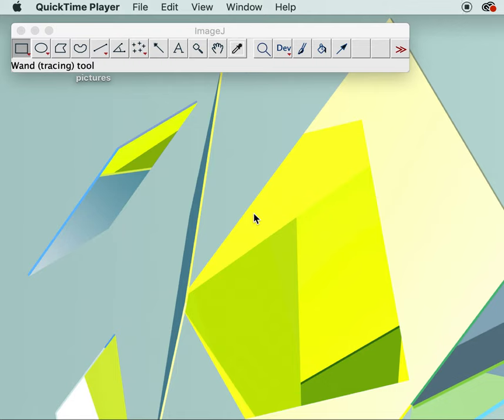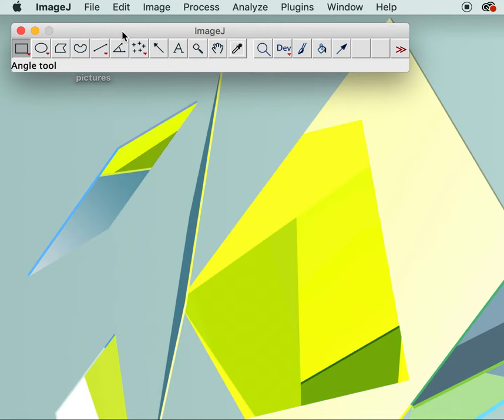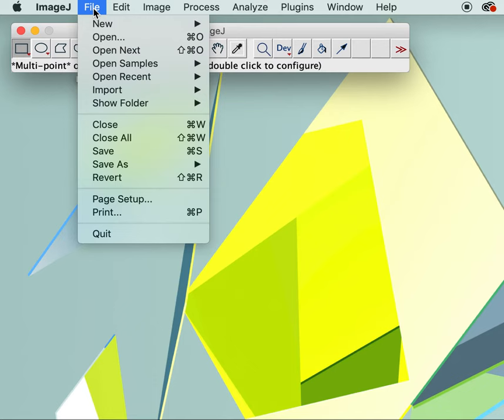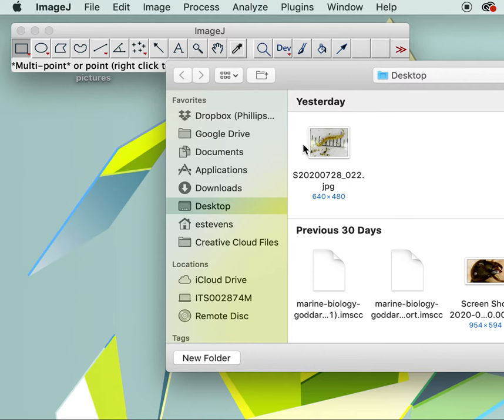I'm going to show you how to measure and label your pictures using the program ImageJ. ImageJ should be open on your screen and if you click on this bar here you'll see a menu across the top. First thing we want to do is open one of our pictures in the program itself — you go File > Open and find your picture. This is one I took of a midge fly larva.